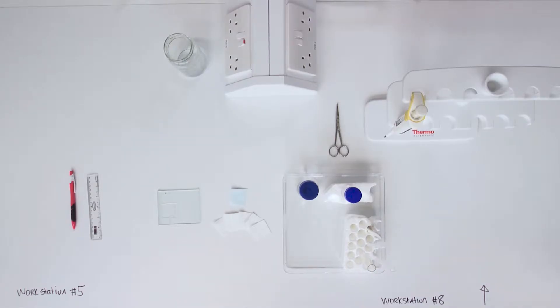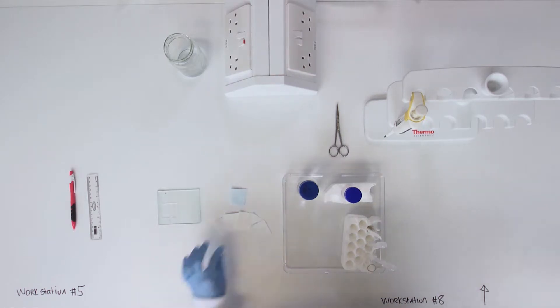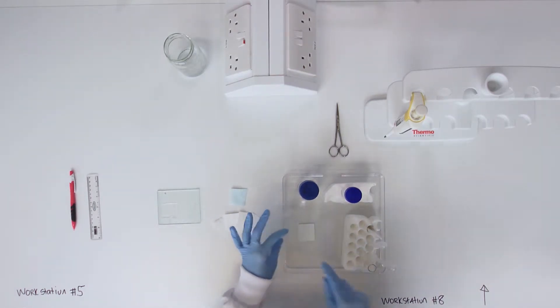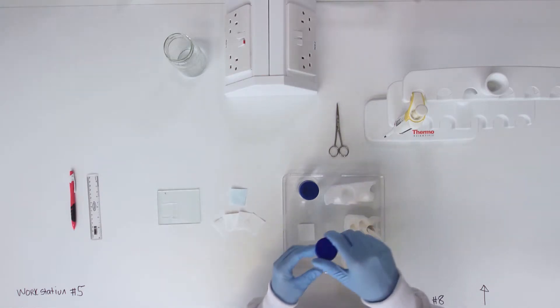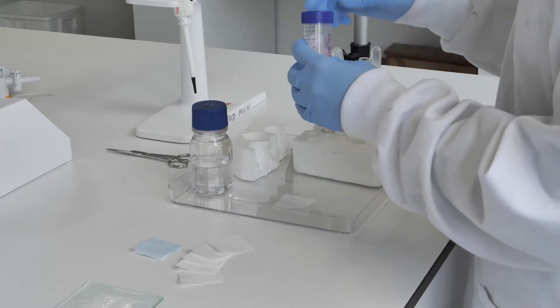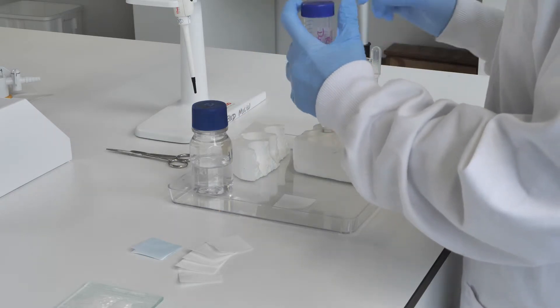Assemble the blotting sandwich on a clean, flat surface. Lay three sheets of filter paper down, wetting each with transfer buffer and rolling with a clean glass tube to remove air bubbles.